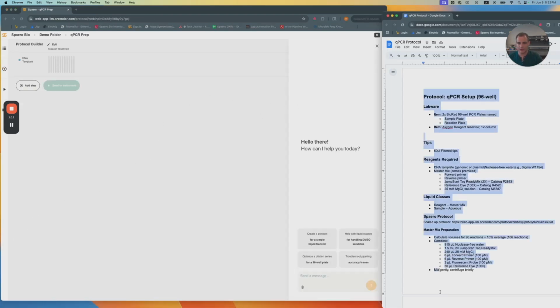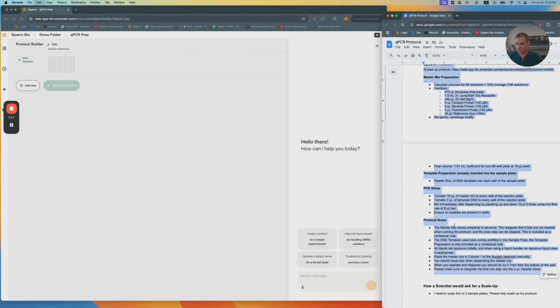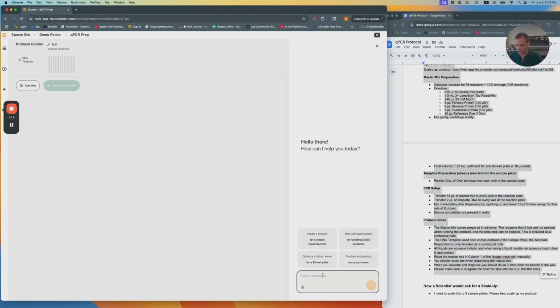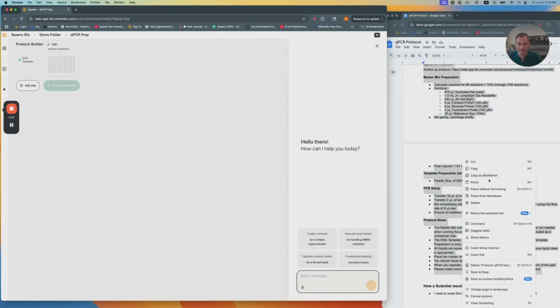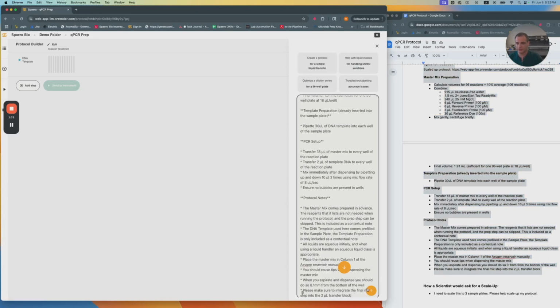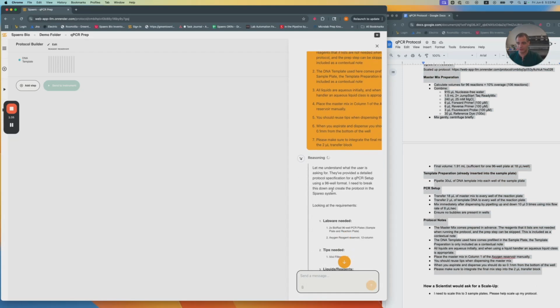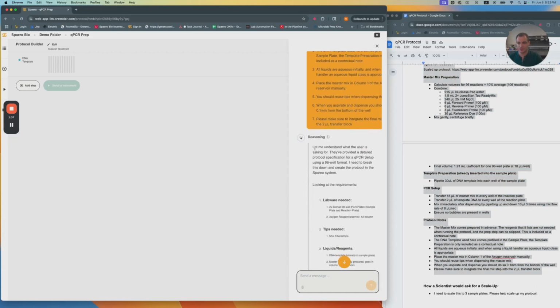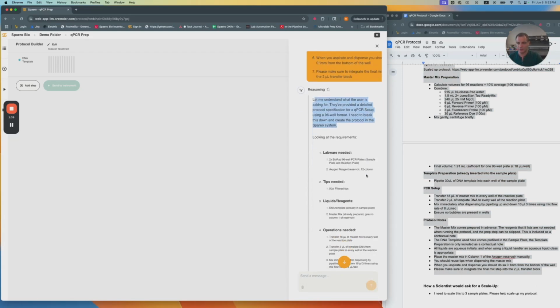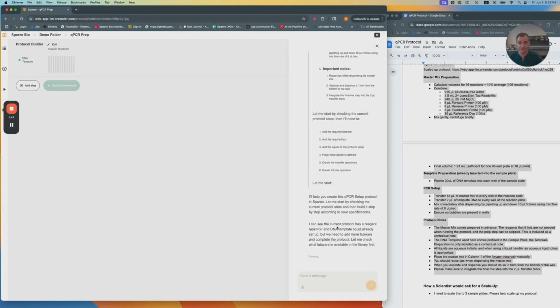Let's go and copy in our SOP and paste it here into the Copilot. To be even fancier, let me copy it here as Markdown so you can see all the nice formatting. We've now sent it all up to the agent, and one of the reasoning models is thinking about it. So first it shows that it understands what it is being asked to do, reiterates the protocol and the other requirements. Now it begins.